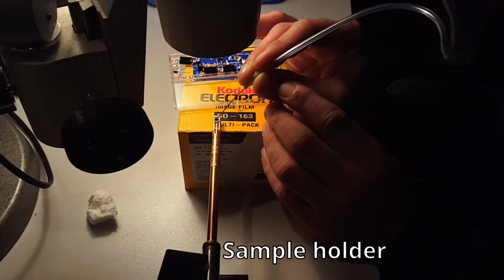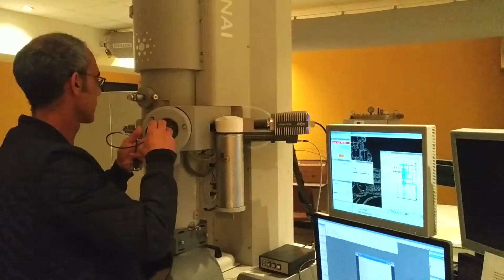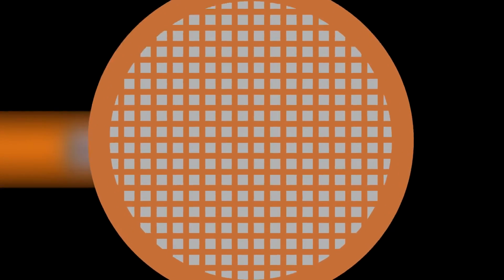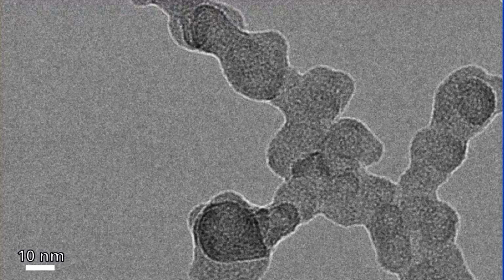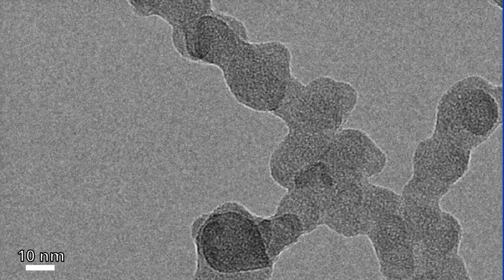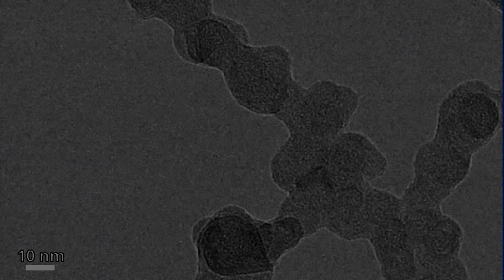After the sampling, the copper grid is carefully placed and fixed in the sample holder. The holder is then inserted in the TEM instrument. A TEM instrument is capable of imaging nanoscale specimens, capturing even fine details in their structure. Ultrafine combustion-generated particles can be observed here. Each one represents an aggregate of several primary particles, of only a few tens of nanometers in diameter.